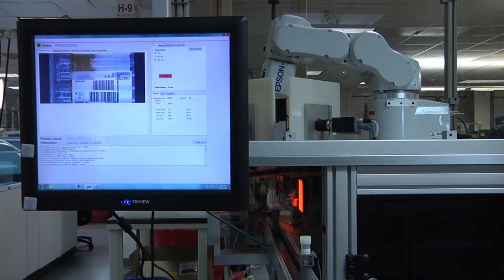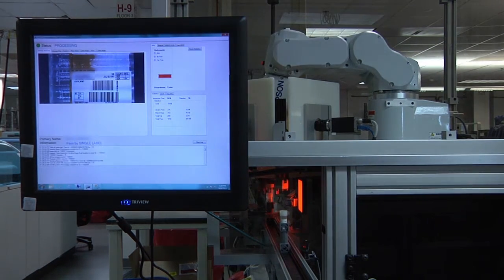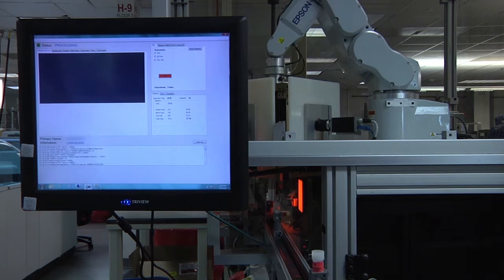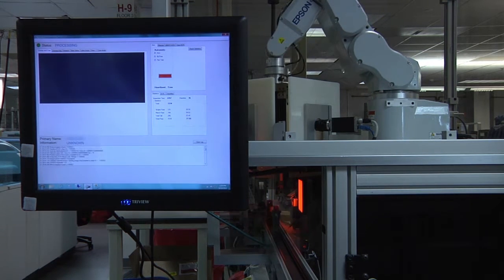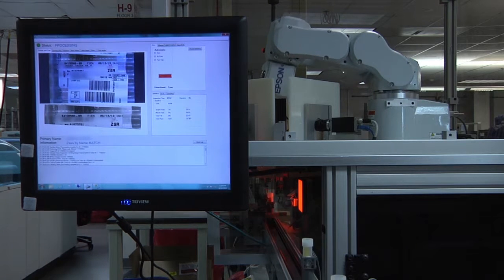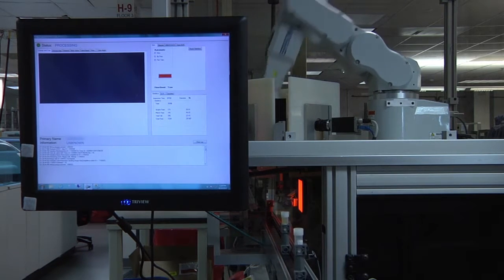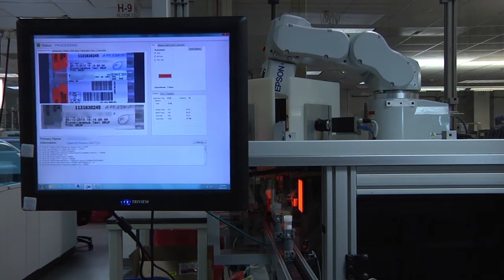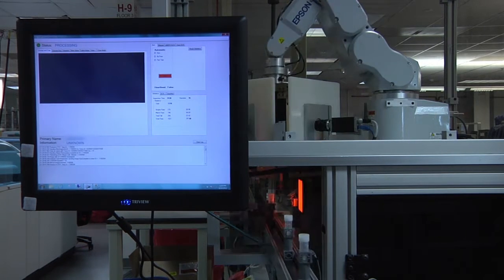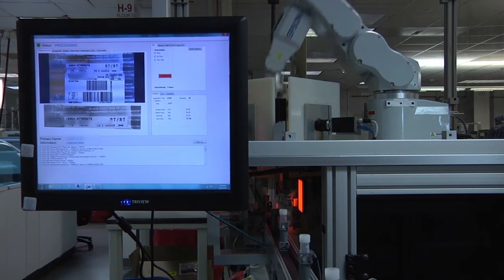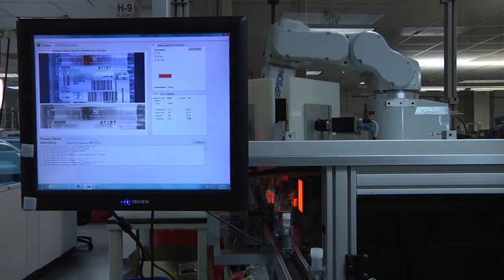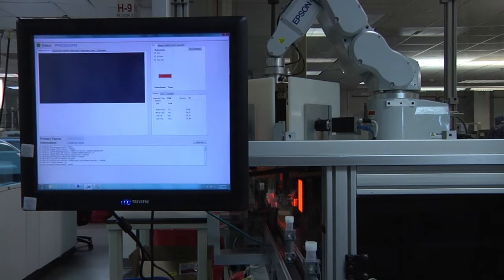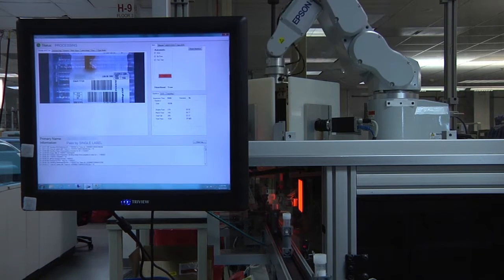This view shows more of the entire system. The robot is on the right. On the left is the operator's computer screen, which shows each image as it is acquired and the results of the OCR analysis. In this view, all protected health information has been blurred so that it can't be read. However, you can see the screen change to a new image as each tube is photographed and analyzed.